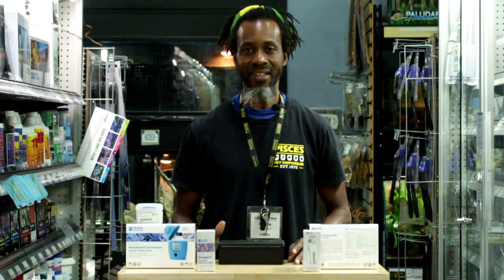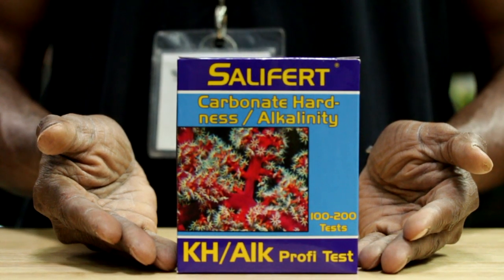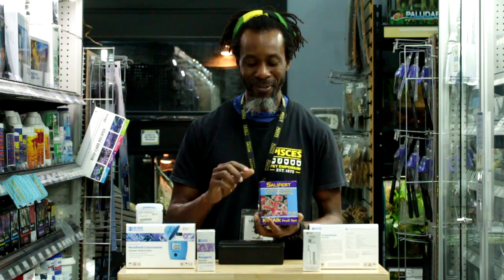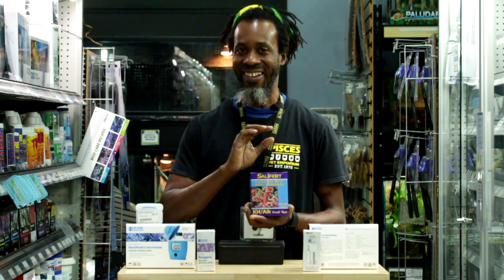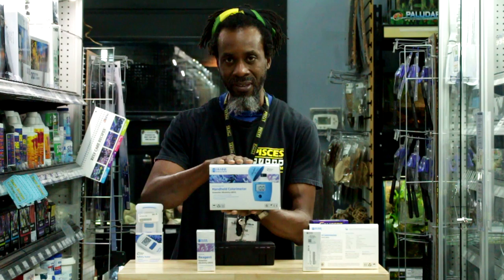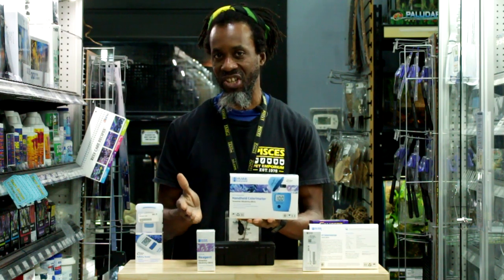I really like the alkalinity checker from Hanna, and I'm going to tell you why. Basic test kits like the Salifert are all reagent tests. If you are busy, whether it's in an environment like this or at home with your kids calling you, I have lost count so many times on how many drops, how many shakes, and you're starting your test over again. These take time, and they're all very color-dependent — not everyone sees color the same way. This is why I really like the Hanna Checker. It's a handheld colorimeter which takes the guesswork out of your eyes trying to decipher what the color change is.